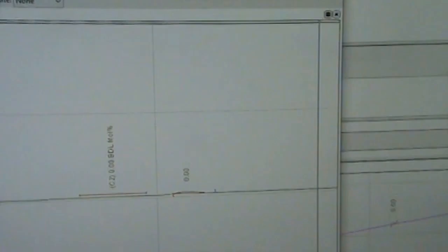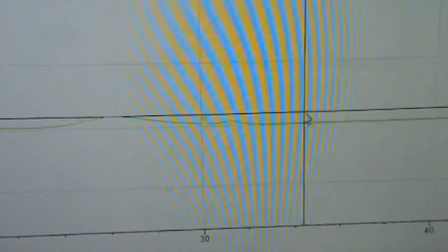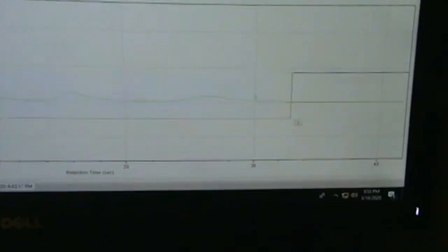Looks like we're, oh, wait a minute, or did we just miss it? Uh-oh. A little bit of heat might have got our ethane in there where it needs to be. Look at that. So let's go ahead and take a look at our RL1. And I think we're chopping a little bit of that off and back flushing a little bit of that peak. So we might want to still scoot that out a little bit because it looks like we are chopping into some of that peak, which we don't want to do.